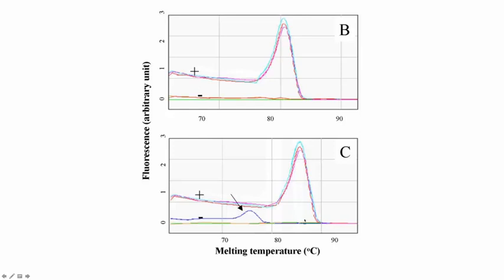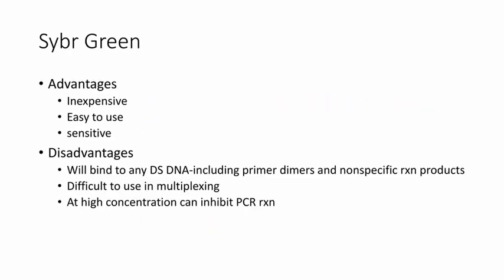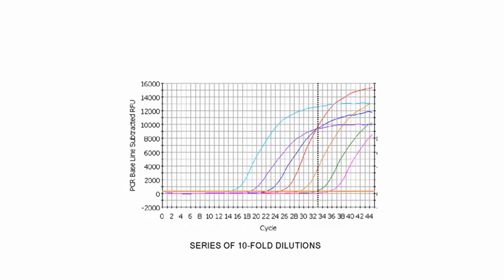And then you can go ahead and be measuring that in terms of, let's go back to this one. You can go ahead and be measuring that in terms of how much overall fluorescence is there in this particular reaction compared with how much DNA there is. So this is a basic idea of how real-time PCR works.